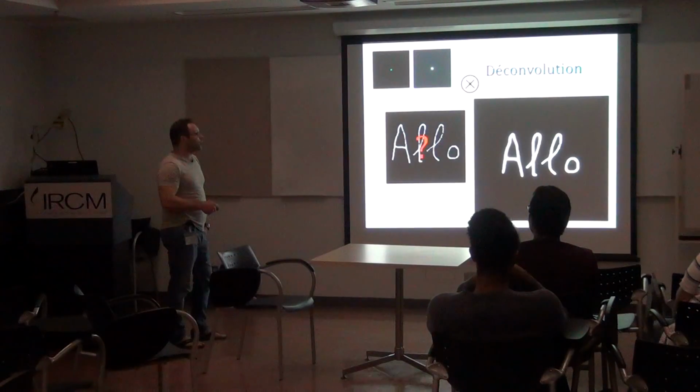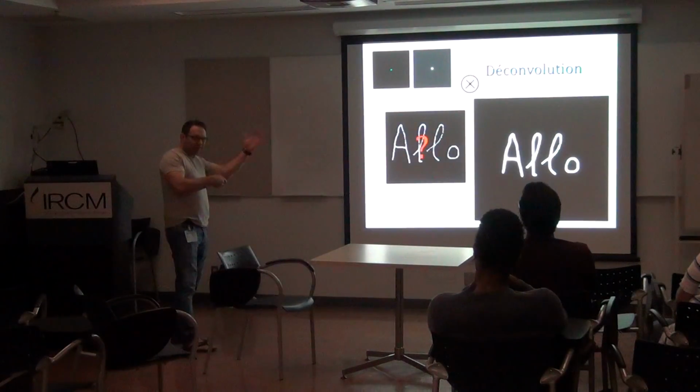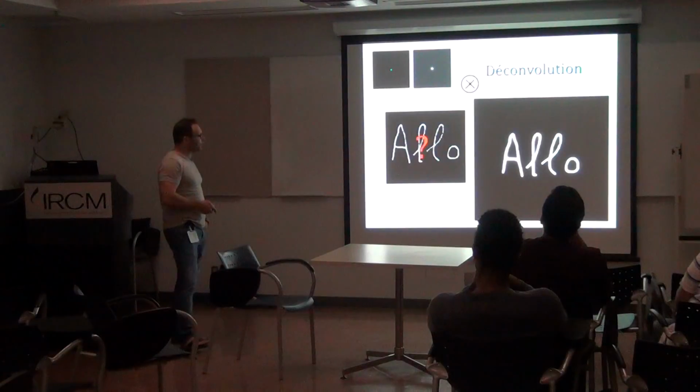is called, you can note it, maybe I didn't write it anywhere. It's the PSF, which is the point spread function. So it's this function here. We call it point spread because it's the point that spreads out, and it's the function that shows it. So the point spread function.